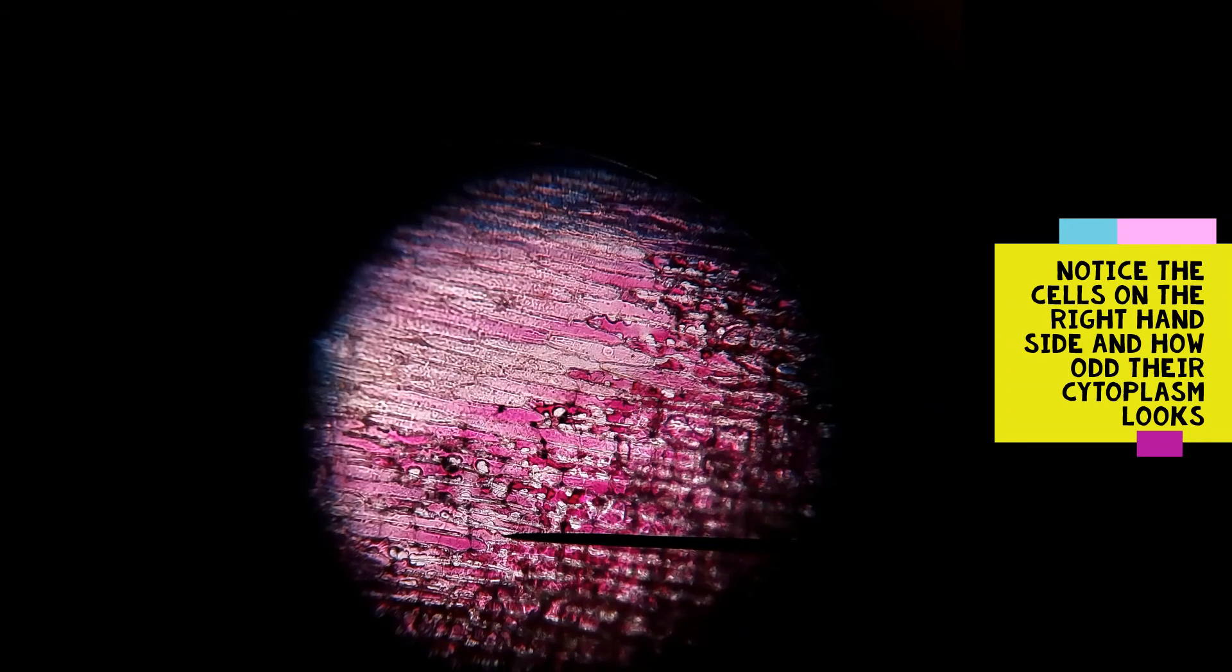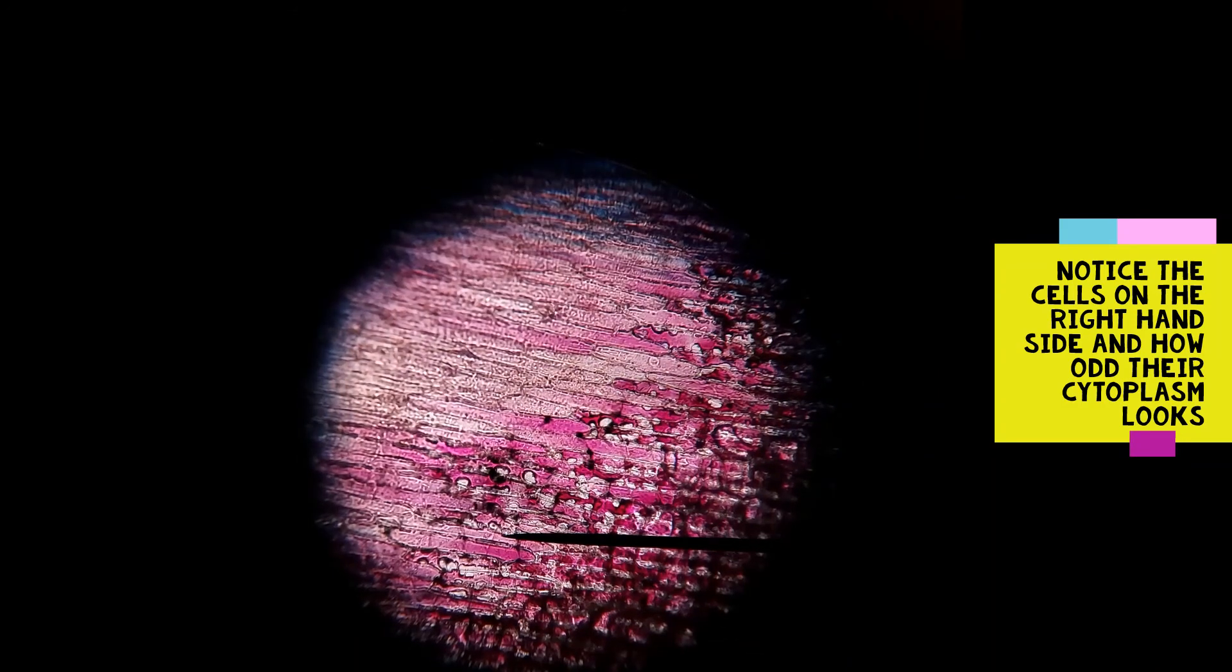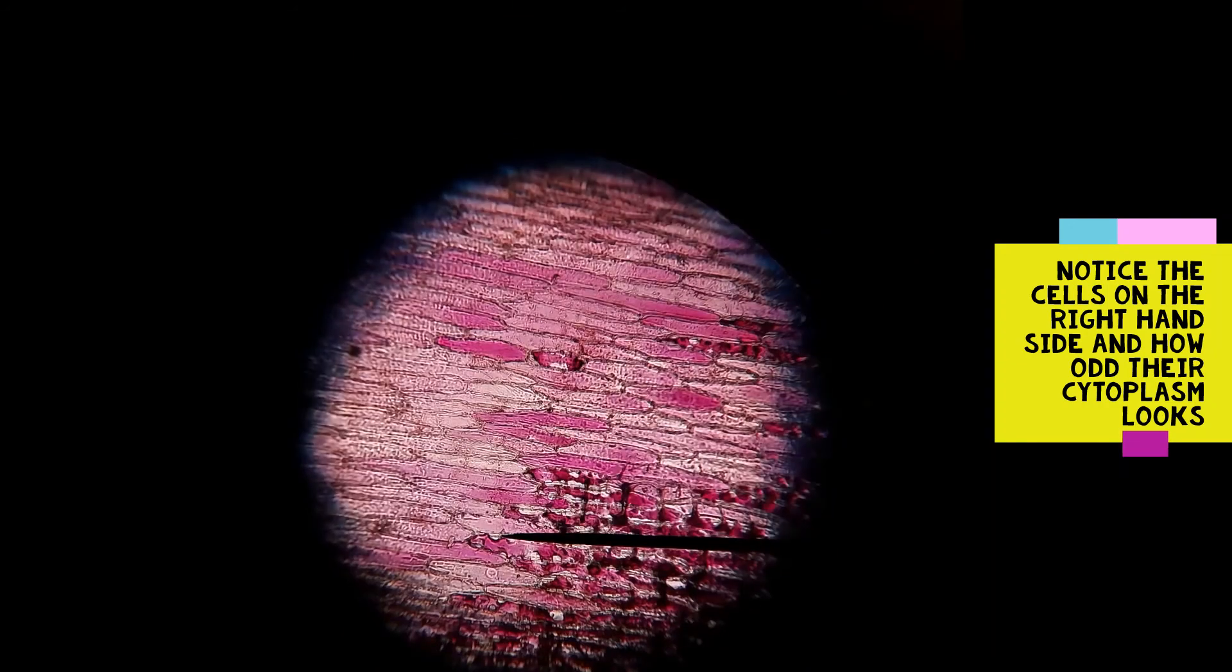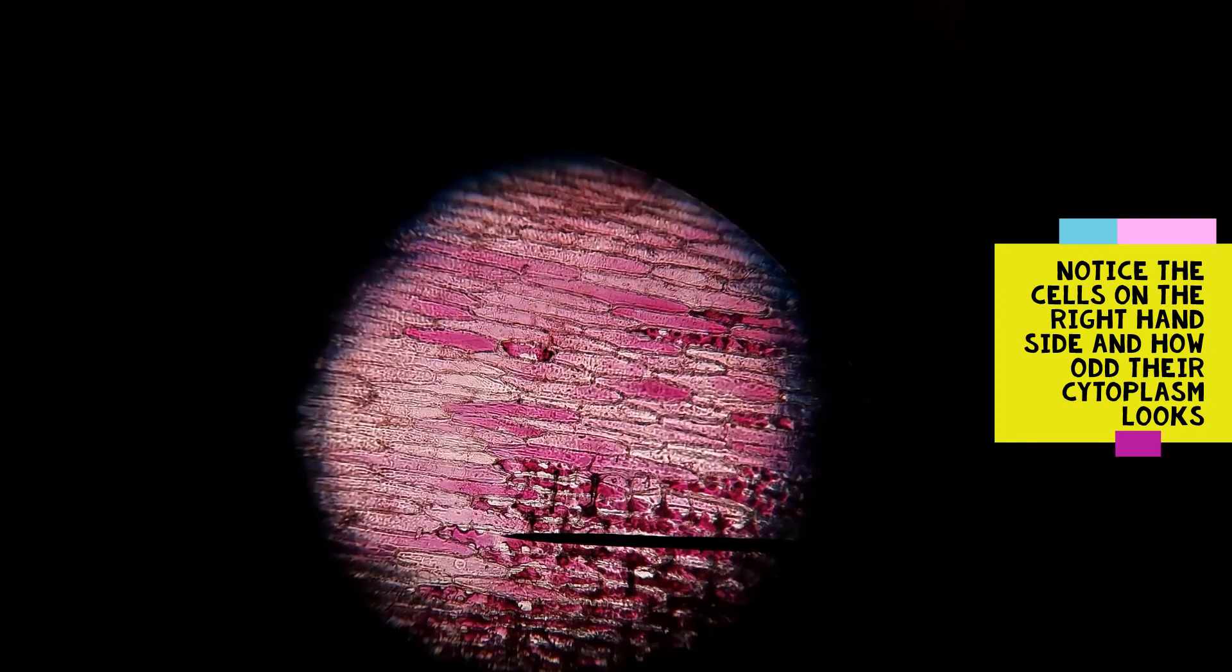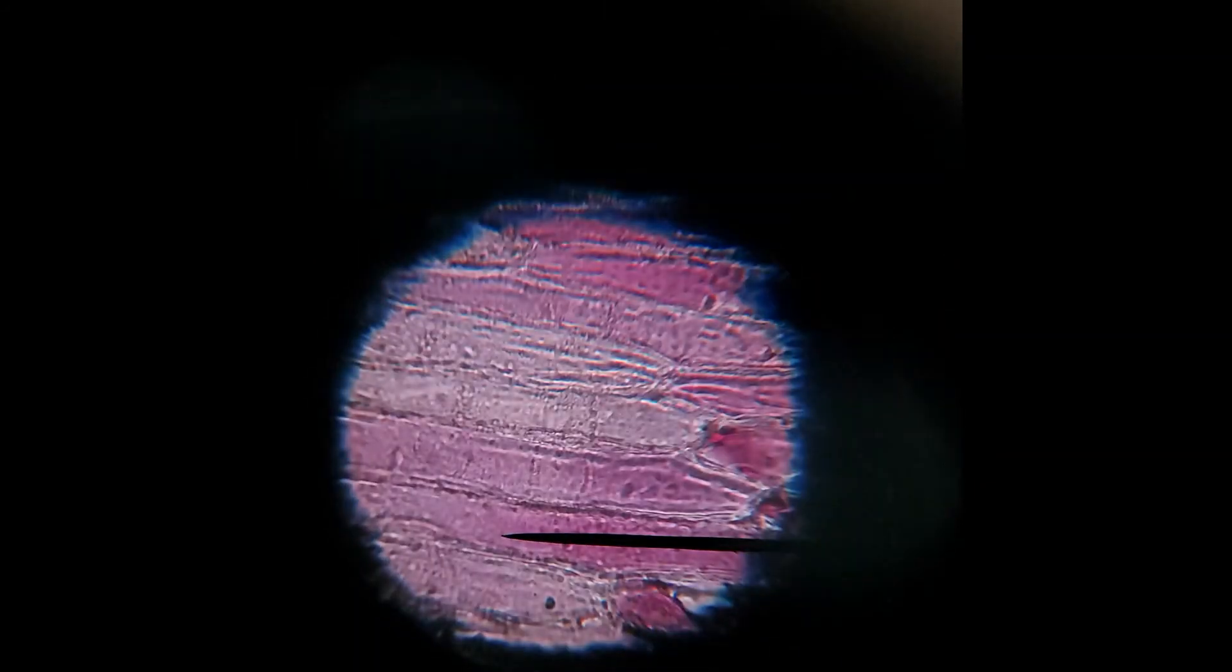Especially there. Let me just bring the... as you can look around here, very clearly. I'm just going to go where the needle suggests, there. If I go in by zooming a bit more, to there.